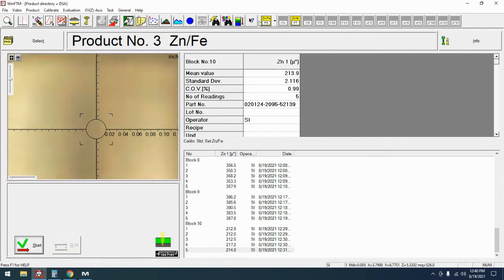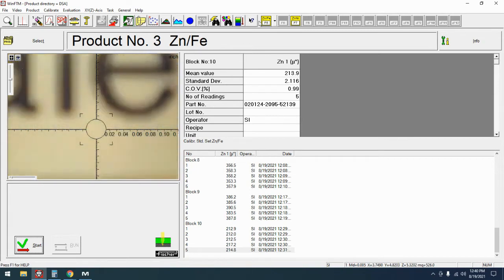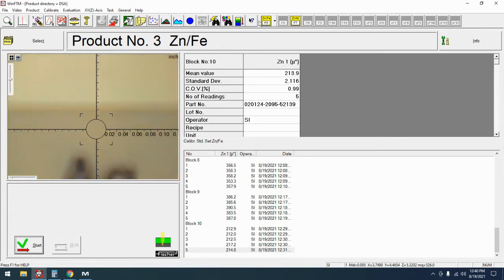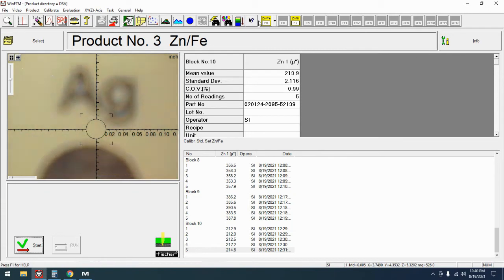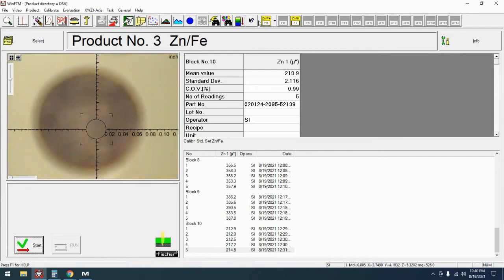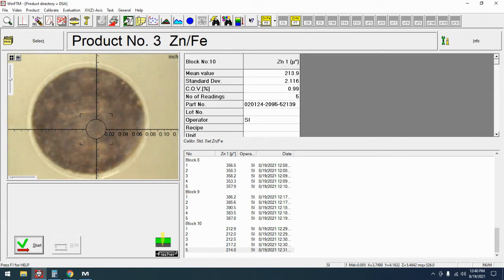All right to do a reference measurement you are going to need your pure element card. Every Fisher should come with one of these pure element cards. If it didn't let us know we can help you out and get you just the elements that you need for your applications or even just for your reference measurement.